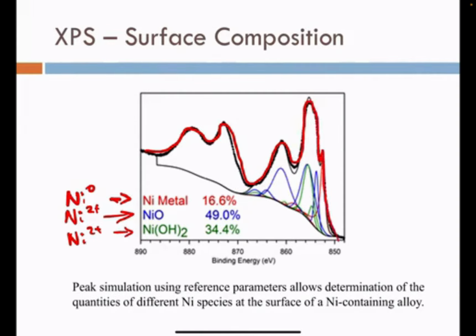In short, the fitting curves are mathematically added, and you are applying the fitting curve to represent each area. You fit the curves so that you can look at the fitted graph that we need to recreate, expected to split into signals at 2+ binding energy.